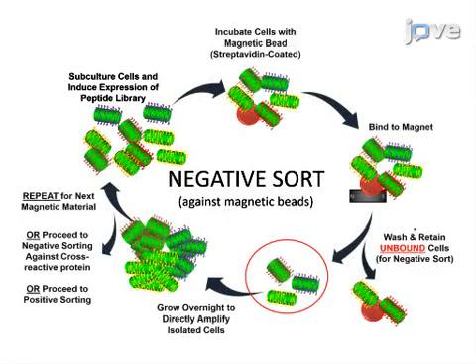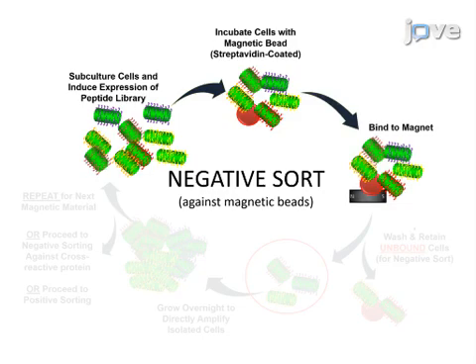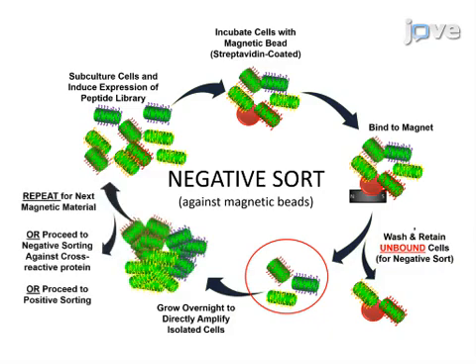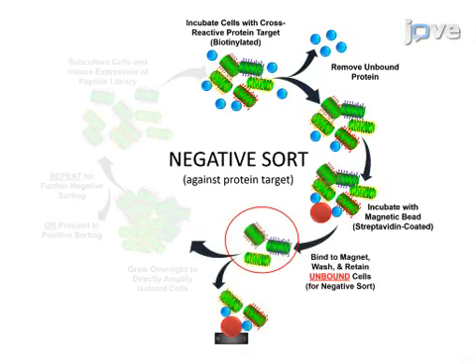Biopanning bacterial display libraries is a cyclical process that begins with negative sorting against the magnetic beads themselves to remove any non-specific binders to the bead material or any attached capture proteins. The negative fraction that does not bind the magnetic beads should be retained. Additional negative sorting can be performed against any potential cross-reactive protein targets, and the negative fraction that does not bind the magnetic beads is again retained.